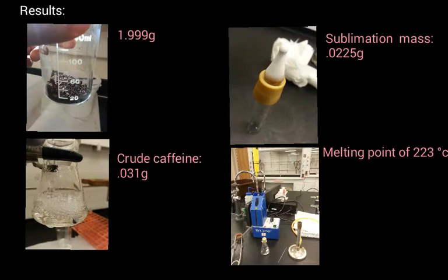Results. The student initially had 1.999 grams of tea leaves. The student then obtained 0.031 grams of crude caffeine. And after sublimation, the student had 0.0225 grams of caffeine. And last but not least, the melting point. The student received 223 degrees Celsius for his melting point of caffeine.